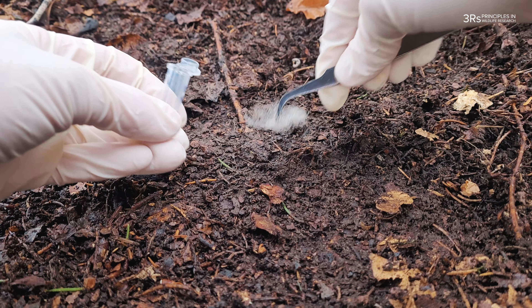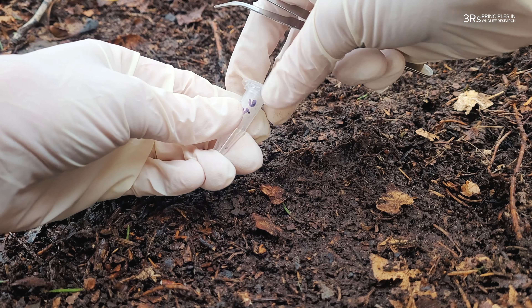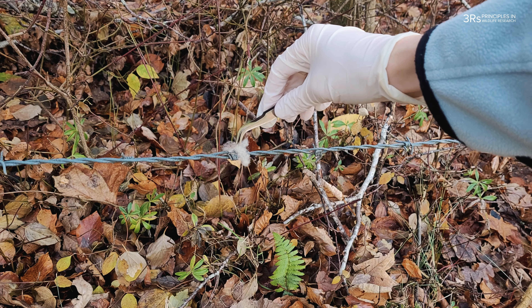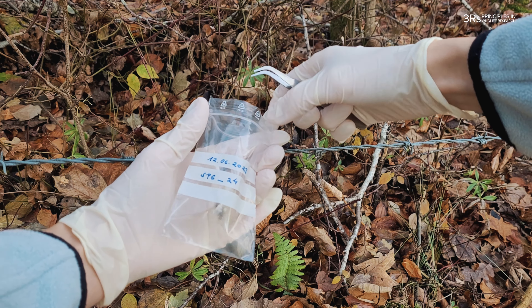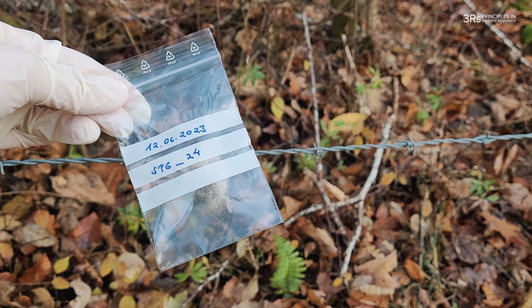Pick up hair from these areas using clean forceps and store it in a labelled bag or a sampling tube. Another option is to use barbed wires, which can act as excellent hair traps. They might be used with or without a lure that attracts the animals to the location, increasing the chances of hair collection.